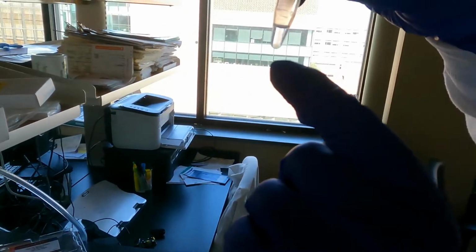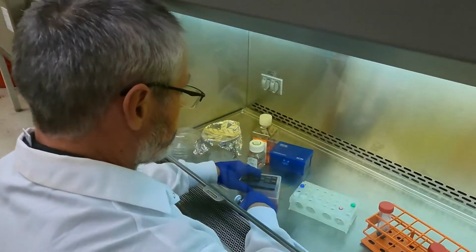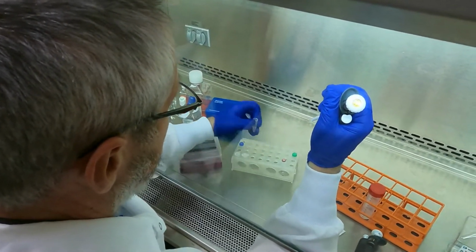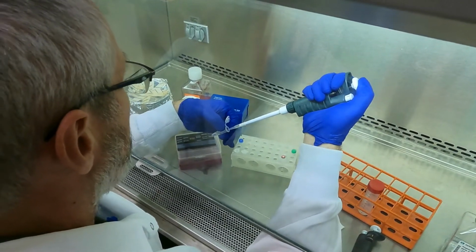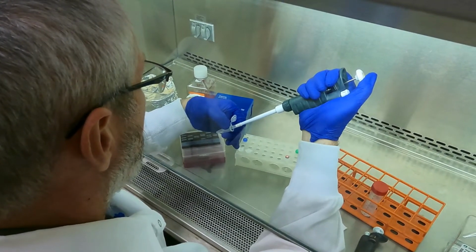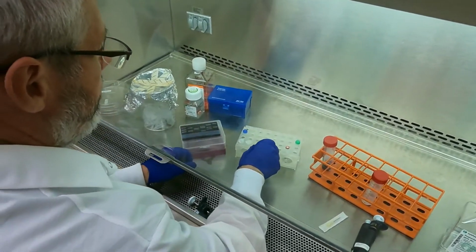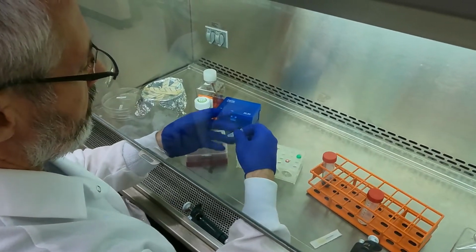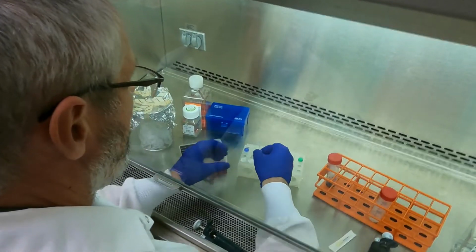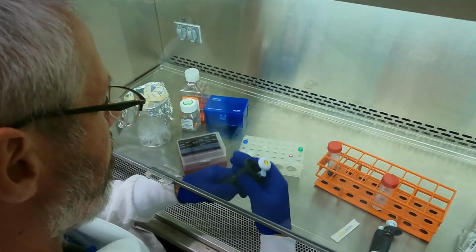Now you can see your cells there. Okay, so we're going to go and take those up in the buffer off. All I got to do now is take that buffer off very carefully, not disturbing the pellet too much. There we go. And just gently break up that pellet again. And we're going to just take 100 of R.